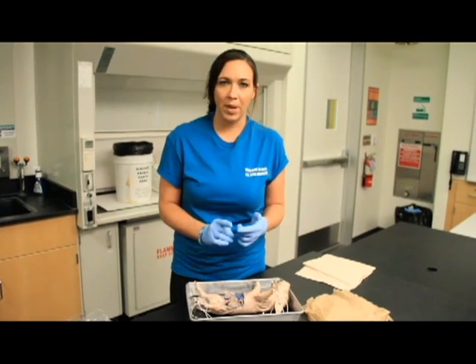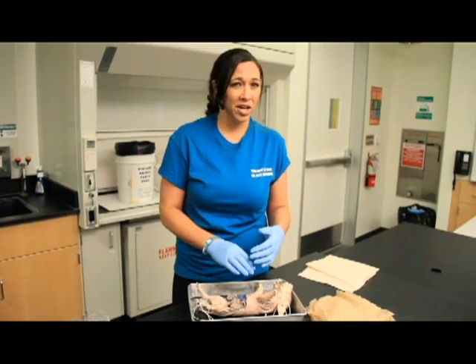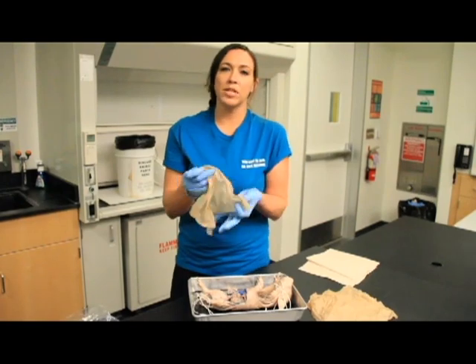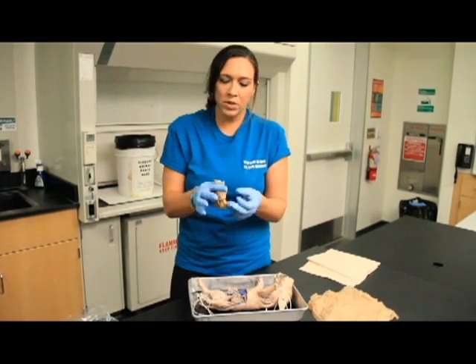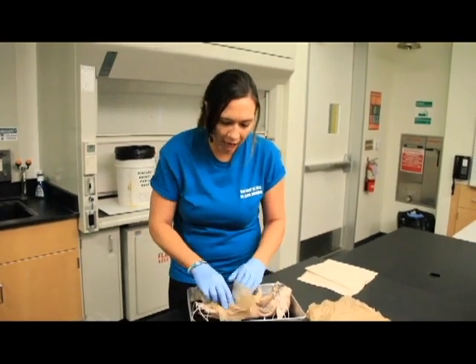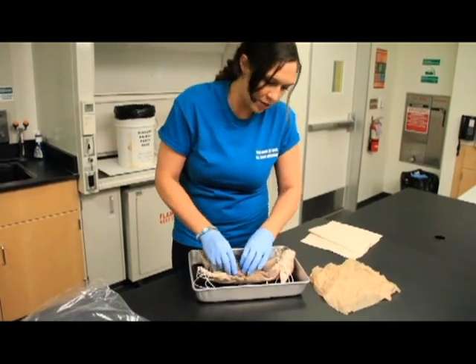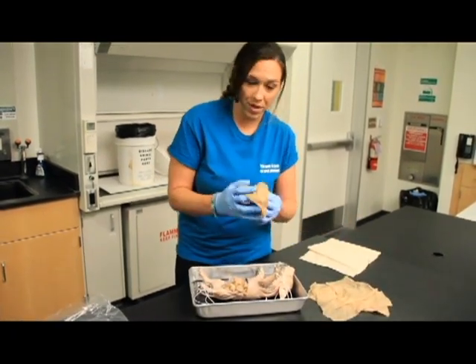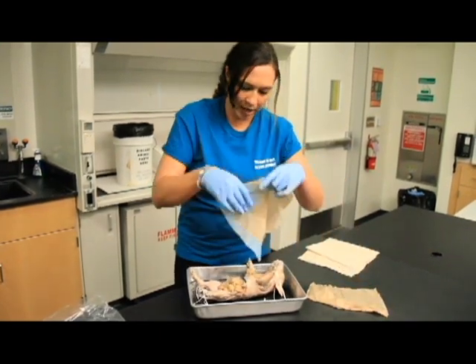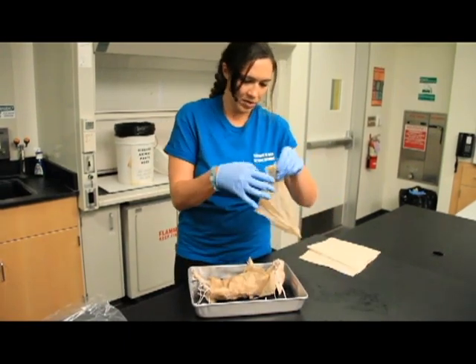Then what we're going to do is pack anything that's exposed, and cover that with damp paper towels. Damp, not wet. If they're wet, then you're going to start actually deteriorating some of your organs and it's going to be really gross next week. So we take a paper towel, get it wet, and then wring it out. Once we've wrung it out, it's nice and damp, but not wet. And again, we're going to cover anything that's been exposed. Any of these organs or open spots that have been exposed, we're going to start packing with these moist towels. And again, the throat, the chest, and the body cavity, until it's all nice and covered, like so.